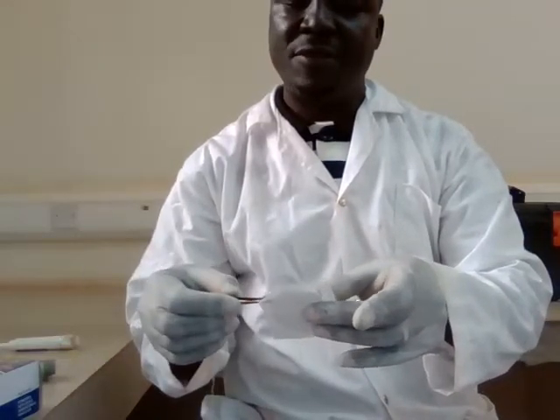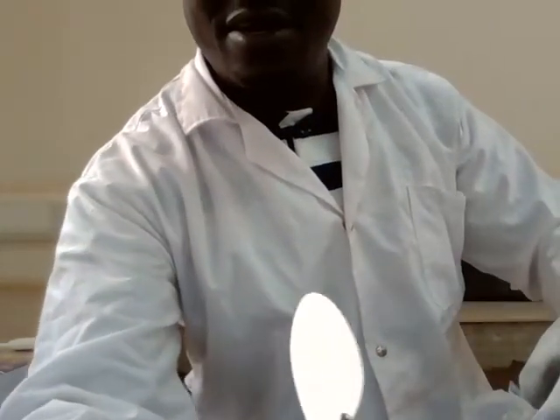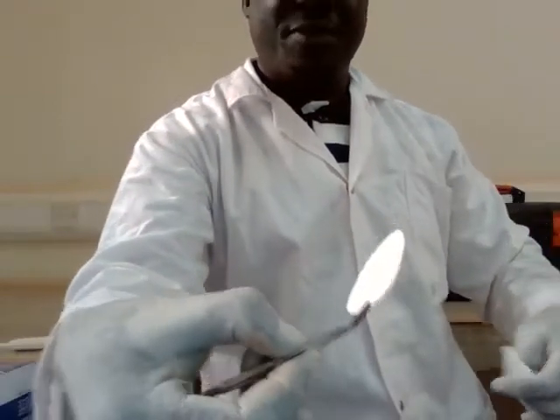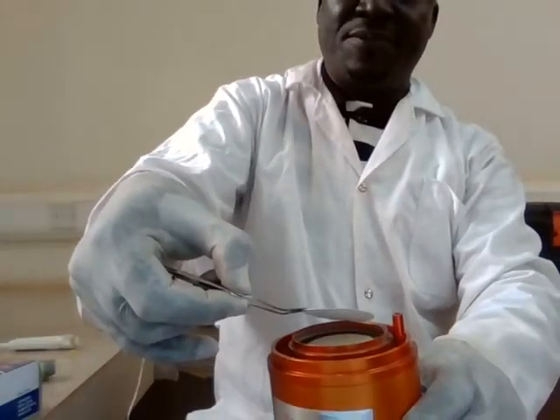With this sterile forceps, pick this. Then this has a grid like a mark. I don't know if you're able to see the grid. Yes, you can see rows and columns. That should be facing up. So you place it on this surface.